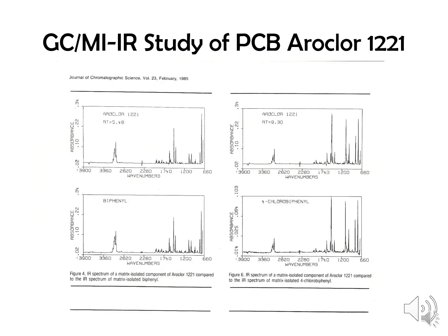Here you see some of the spectra that we get with this. You can see that the biphenyl matches up with the one peak there at 5.48 minutes, and we have a 4-chlorobiphenyl. You see the kind of spectra you get when you have a hit. It's almost unbelievable, almost embarrassingly right on. And so, if you have a positive identification, it's a positive identification.